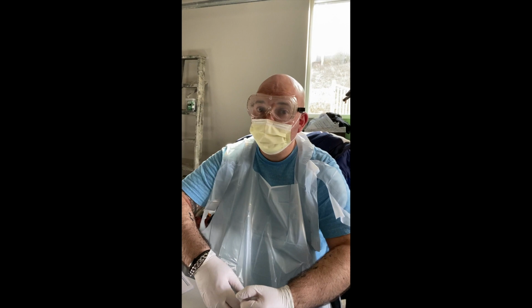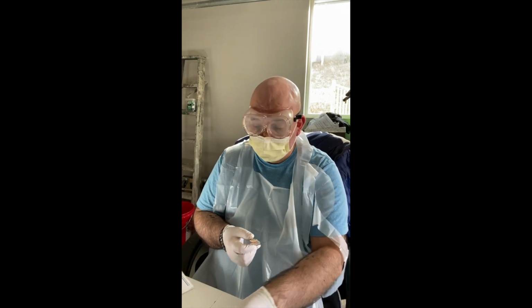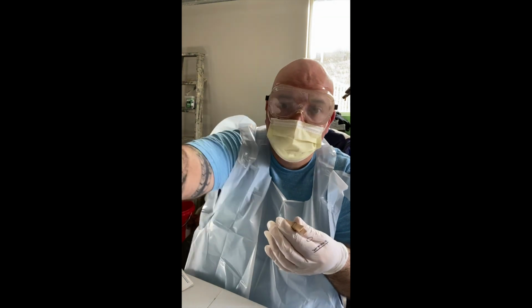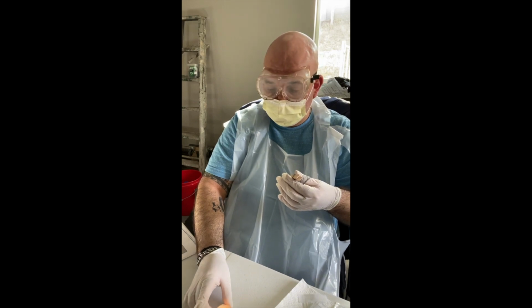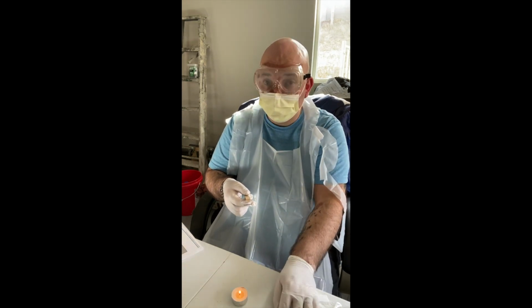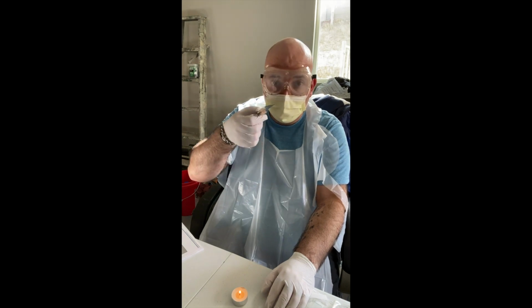Alright, so it's a rather warm day here in Southern California, so my slide here has air dried. So the next thing I'm going to do is I'm going to heat fix the slide here, and using my tea light, what I'm going to do is I'm going to pass the slide over the tea light about 5 times, over the flame here about 5 times, just to make sure that the sample's set. And it's just going to be a very quick pass for 5 times, because of course, glass and heat don't really do well. Because if I pass it too long, the slide will break. And I am holding it with this clothespin.